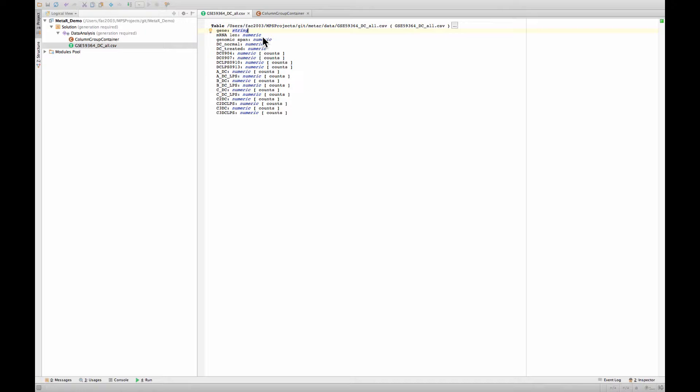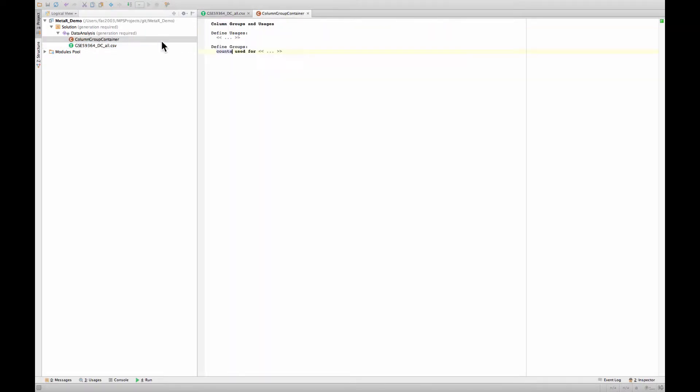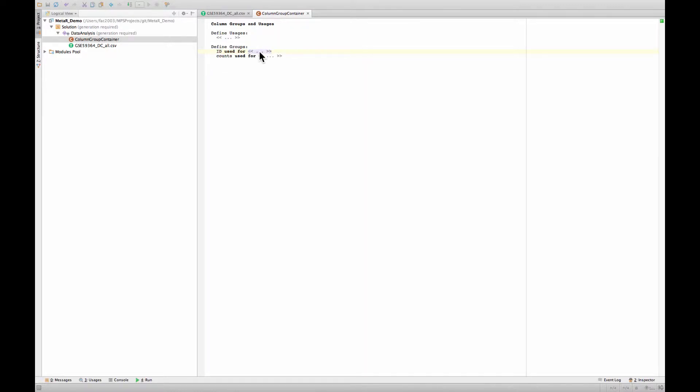Now I also want to indicate that this gene is an ID. Same problem, I haven't defined an ID group, so I can actually do this. If you place a cursor at the beginning and press return, it will create a new group. I call it ID.